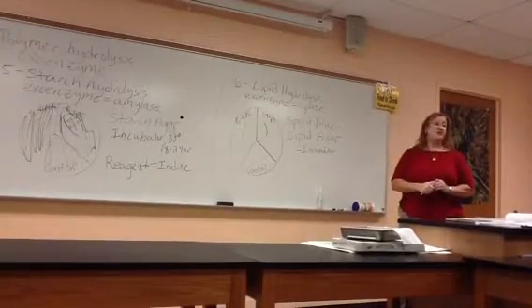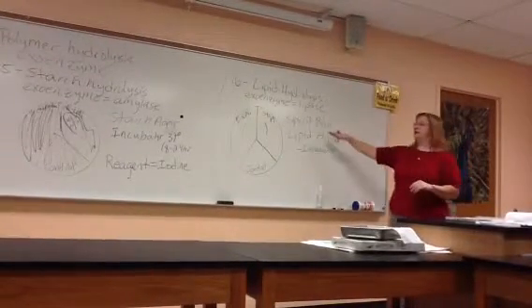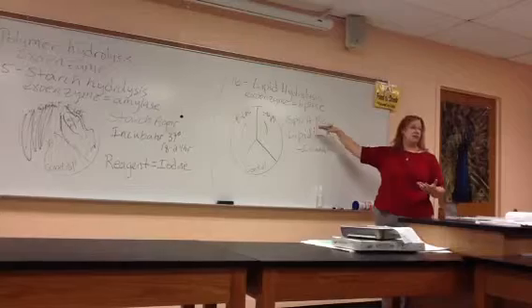There is no reagent for this one though. We don't have to add any chemicals after incubation because the plate's already blue. It's already got some color in it.